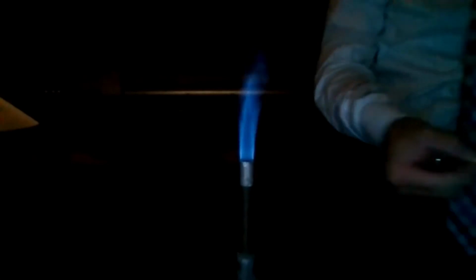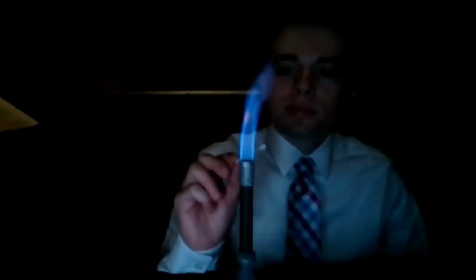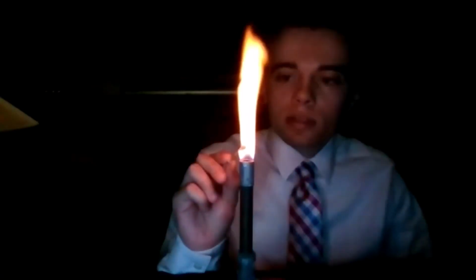Okay, so I dip some strontium in. Ooh. I don't know if you can see this one as well as I can, but it's very similar to the sodium one that we just did, but it's a little more red.